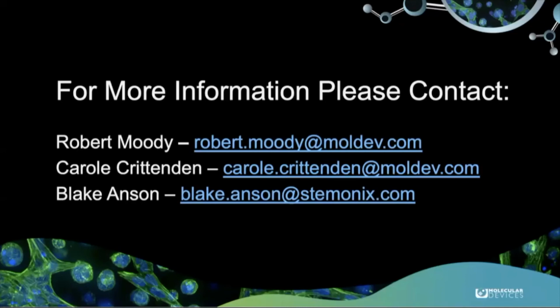Thank you. We got one from Mary West up in the Bay Area. Very interesting. She says, can you talk about the bioinformatics end? Are these your own programs, is the question. In terms of the bioinformatics, we have very limited capabilities with that. We can do qPCR. We can submit for full genome RNA sequencing, and we have that data that we're able to mine for end users if they have a gene of interest, a question about a gene of interest, but we do not necessarily do much of the in-house bioinformatic analysis ourselves, at least not the very sophisticated things.